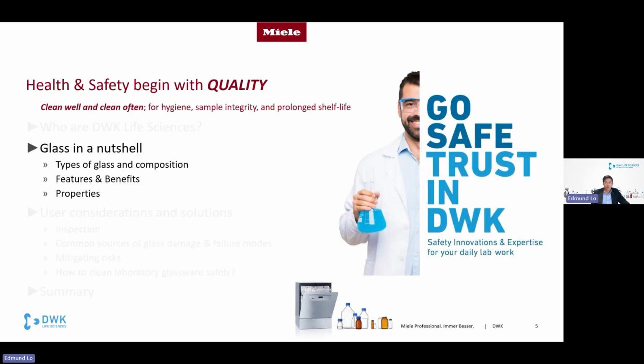Now let's move on to an introduction to glass. In this section, we'll cover types of glass and composition, the features and benefits, and also some properties of glass.